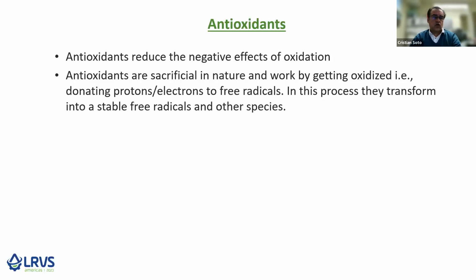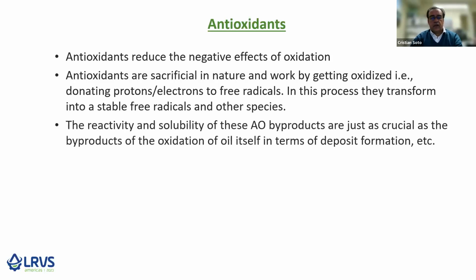They transform into stable free radicals and other species, as opposed to very active free radicals, which are formed when they are absent. The reactivity and solubility of the byproducts of antioxidant oxidation are just as crucial as the byproducts of the oxidation of oil itself. And I'm speaking especially in terms of deposit formation and other functional parameters of the lubricant.